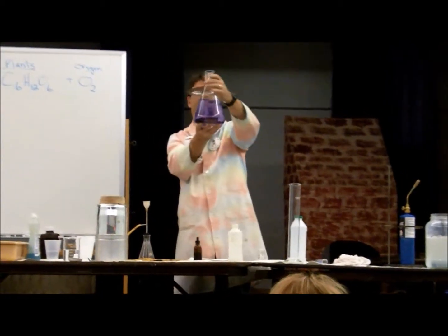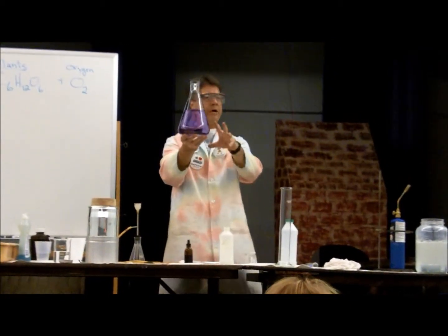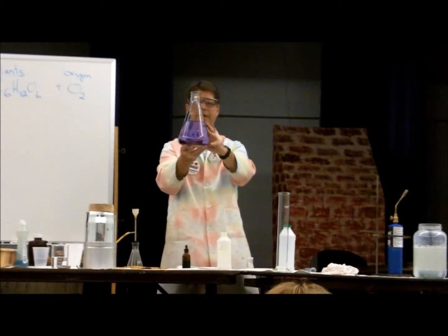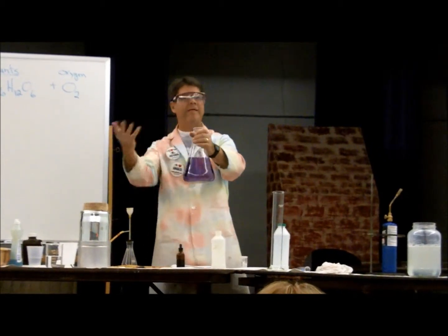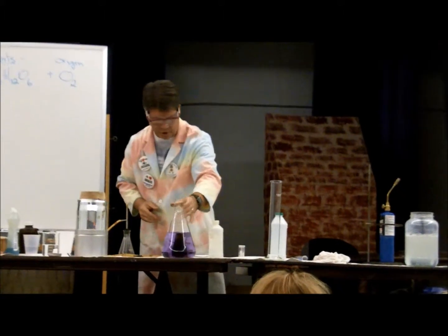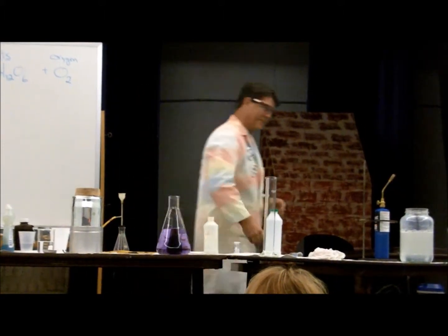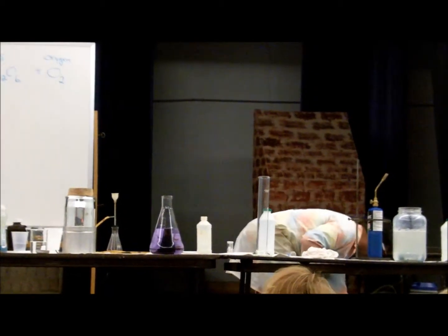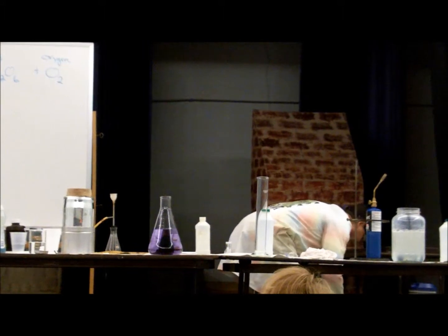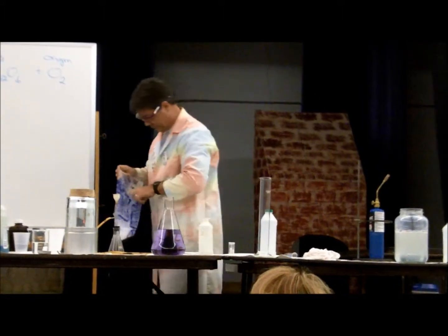Well, what I have here is a beaker of water, or excuse me, a flask of water, and I put a color indicator in it. And what I did is I changed the pH. So I made this what we call a base solution. Carbon dioxide takes water and actually makes it acidic. And we can test that idea by using a very good carbon dioxide source, such as dry ice.